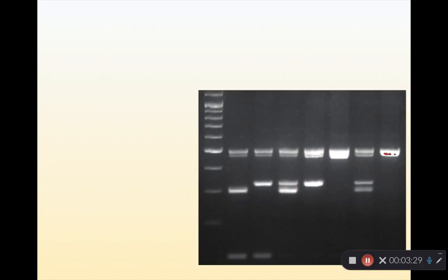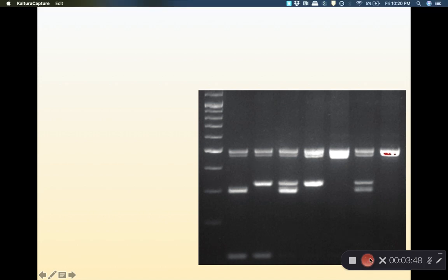A product from a gel electrophoresis might look like this. Each of these slots is where you put your original sample, so for example, A, B, C, D, E. This sidebar is just a gauge to show us how many base pairs would extend to a specific area. So for example, if we know that our band is starting here, we know that there are approximately this many base pairs in that sample.